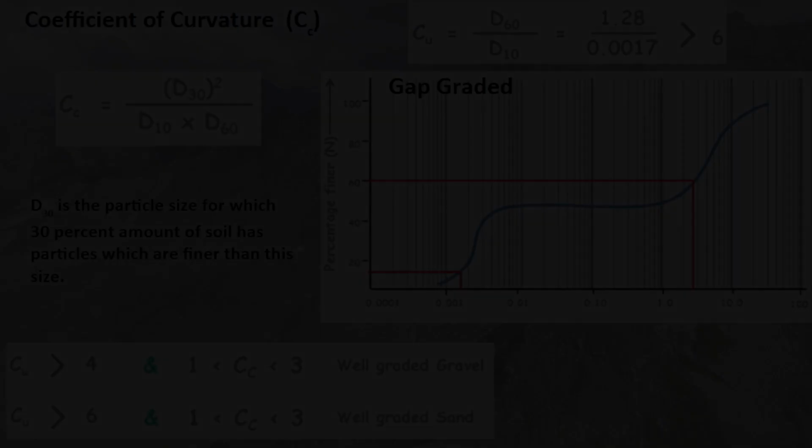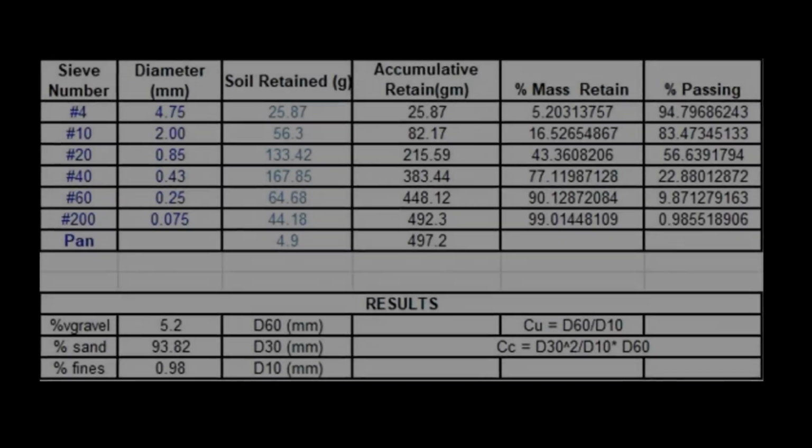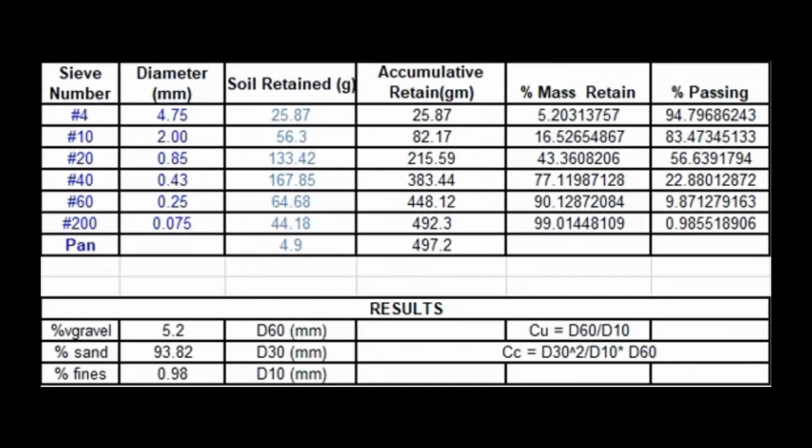But just remember, when you're analyzing your material, I always look at my raw data. So I go into my graphs and look at each one and see what their percentage, grain sizes and weights are. Then I look at my graph and analyze it nicely, and then I do all these calculations if I need to. I do know where my smallest particles are, the biggest, how much percentage of finer grains or coarser grains. And it will also depend on what scientific question you're asking.